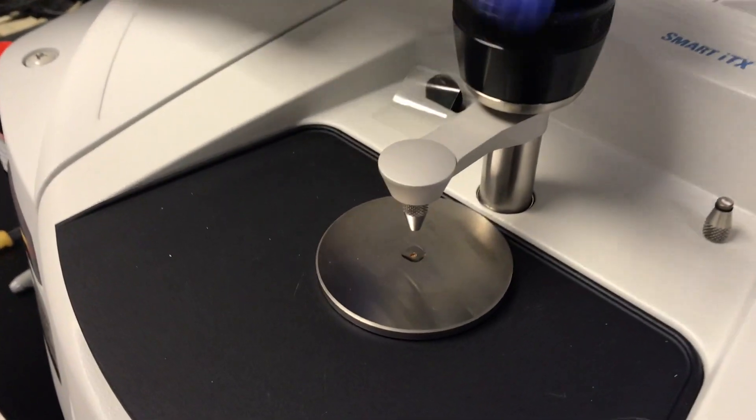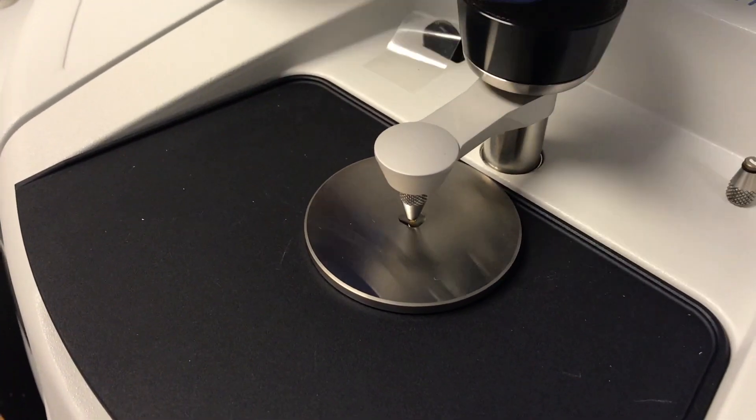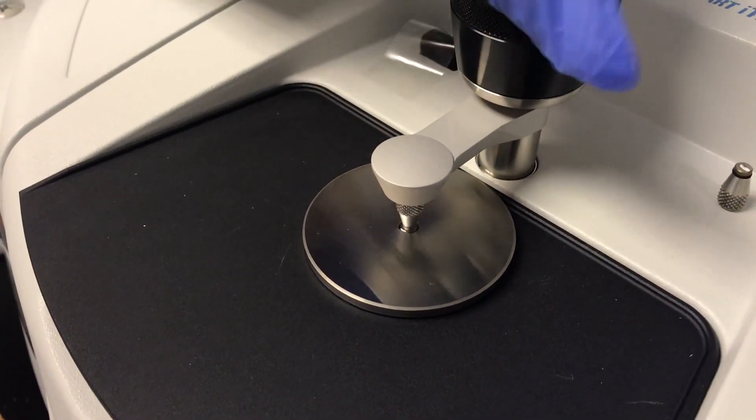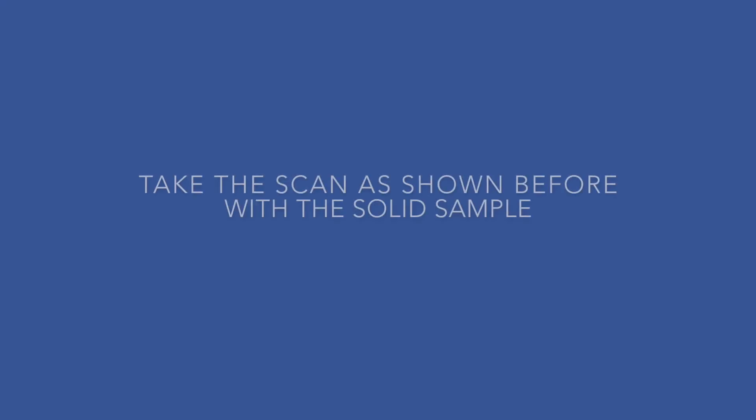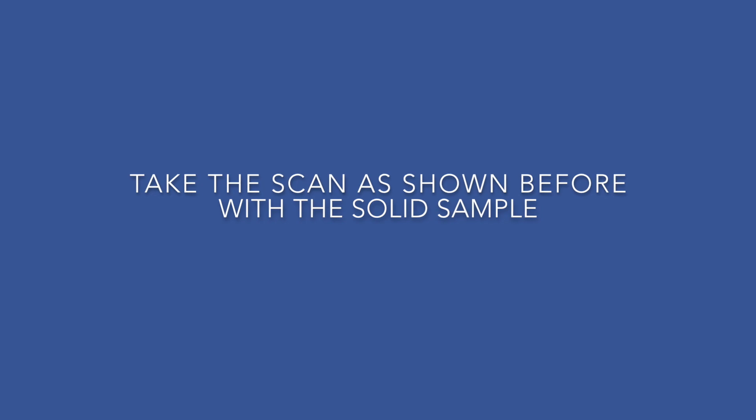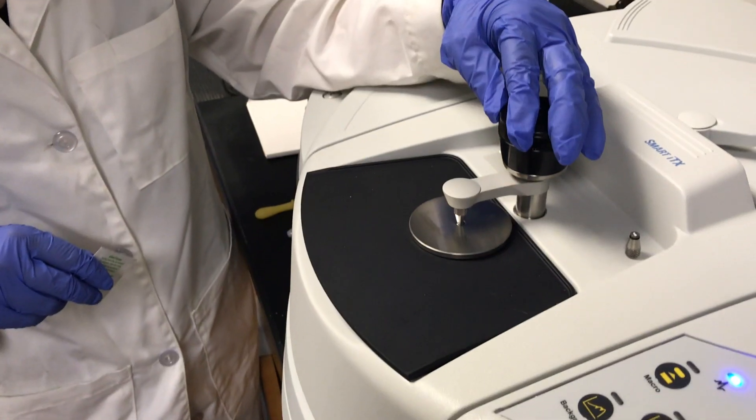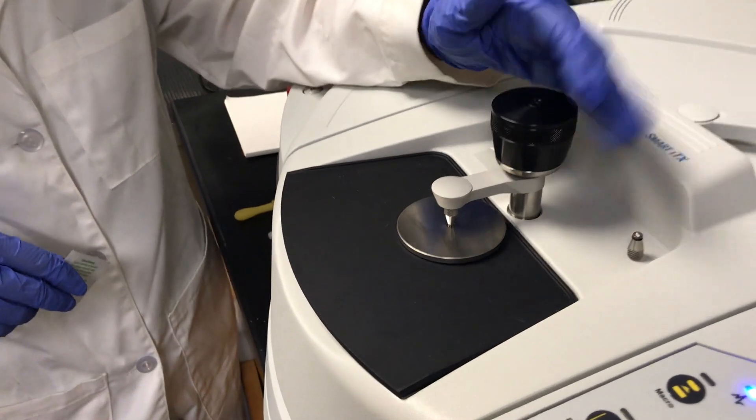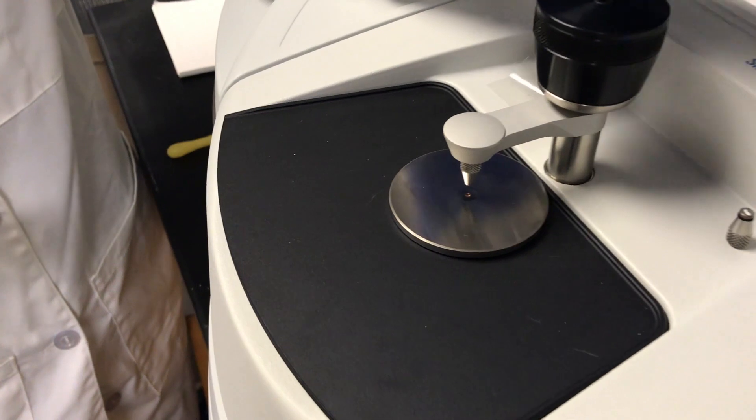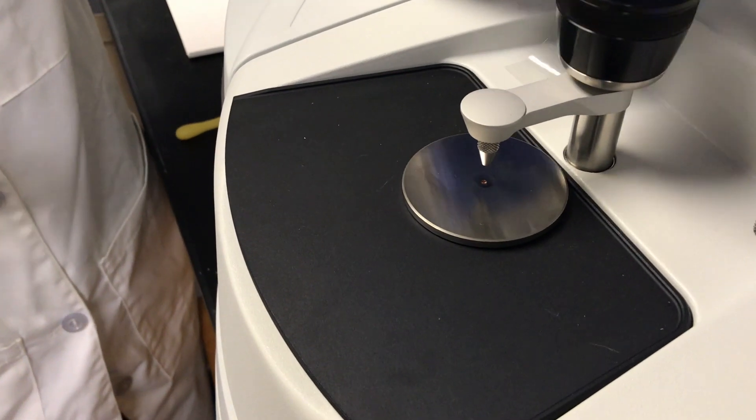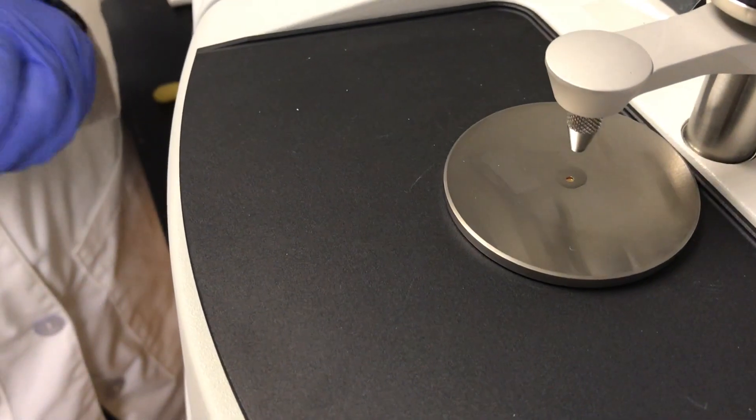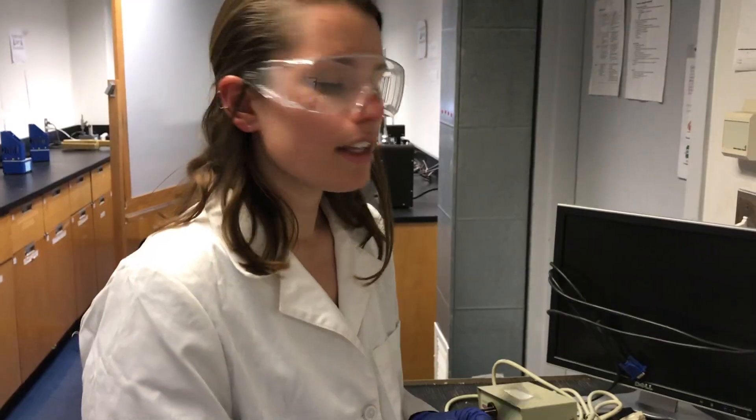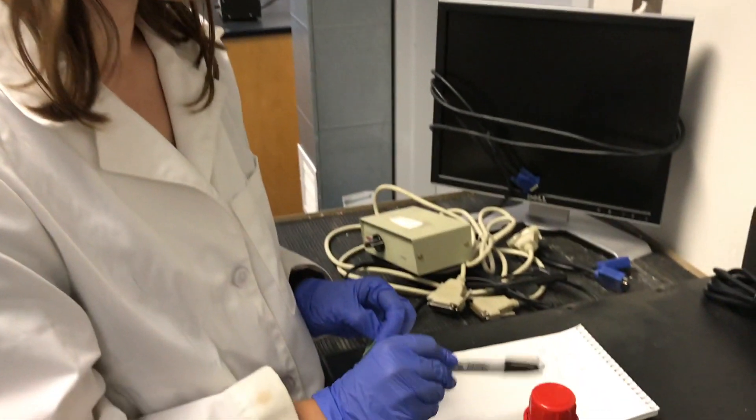Now turn the knob down and then make sure you hear it click once. When you're done with your sample, we're going to clean it again and make sure that it's all set for the next user to use. And then the last thing you're going to do before you leave the room is make sure to sign out.